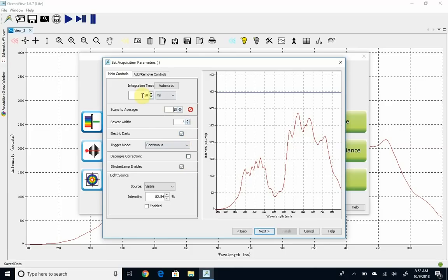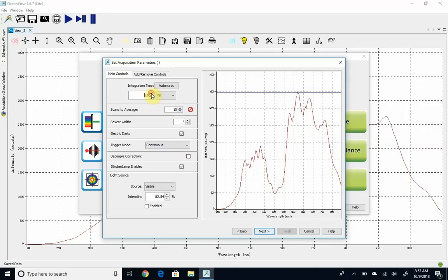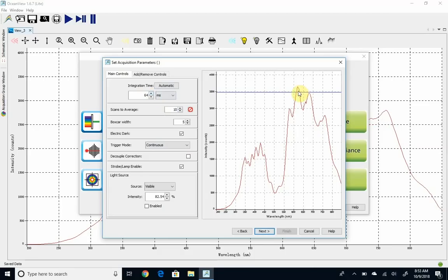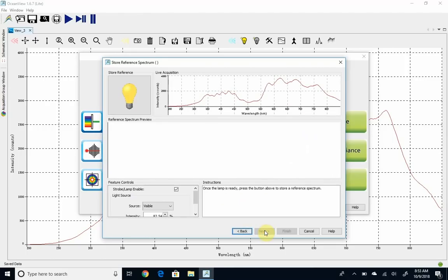Make sure electric dark is selected, and we're going to adjust this up a little bit. Probably about 60, a little after that. It doesn't have to match exactly. A little above or below is fine, but this looks pretty good to me. So I'm going to click next.